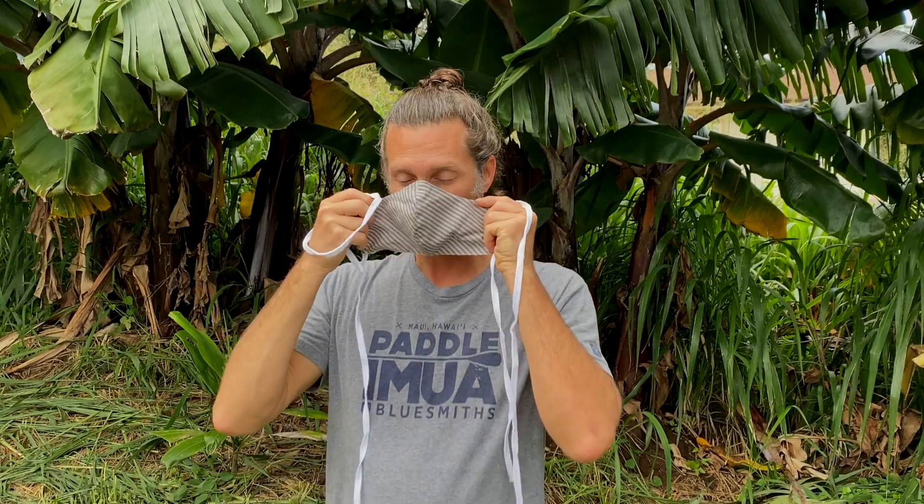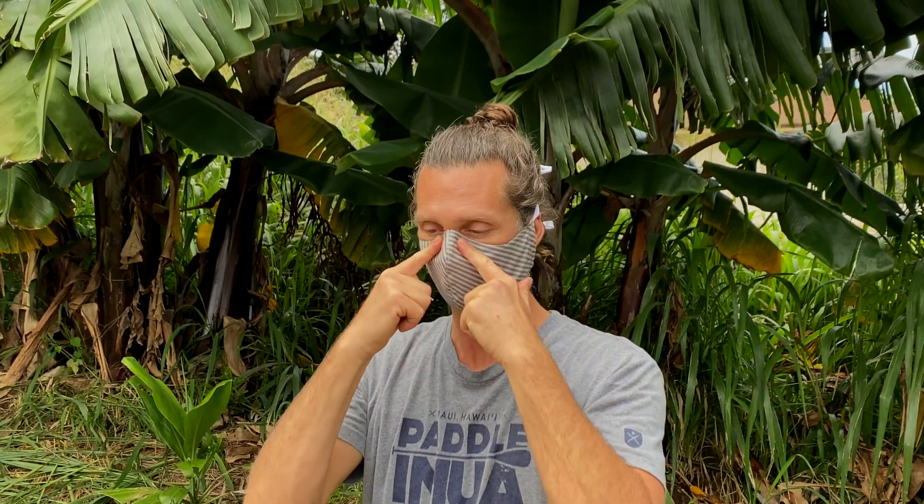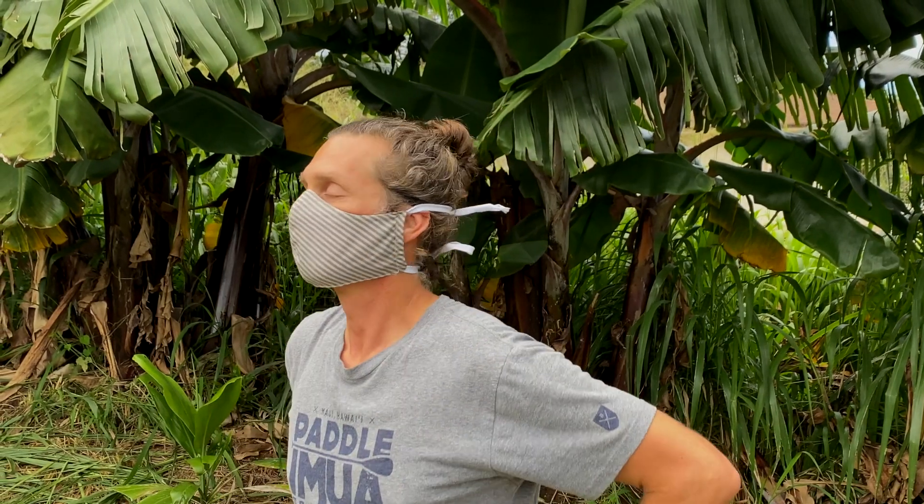Now let's move on to masks that have ties. Bring the mask to your nose and place the ties over the crown of your head and secure with a bow. Tying the mask behind your head takes a little practice — now it's a no-brainer. Next you mold the bendable edge around your nose to match its shape. Then take the bottom ties, one in each hand, and tie them behind your head at the nape of your neck. Lastly, pull the bottom portion of the mask around your nose and chin.